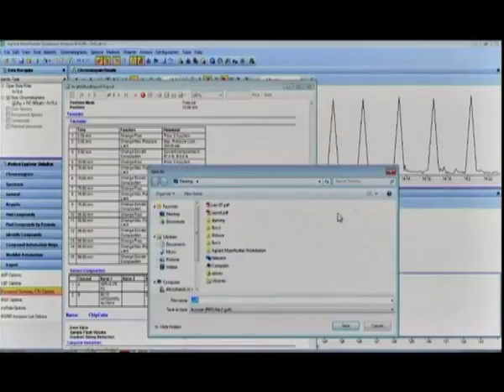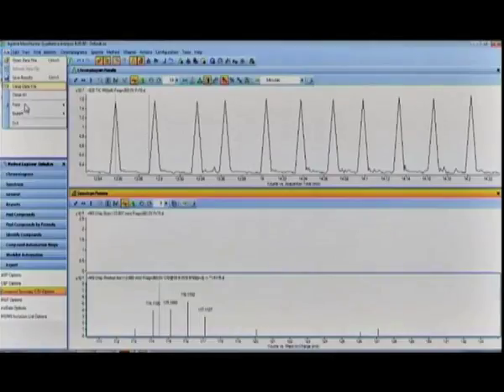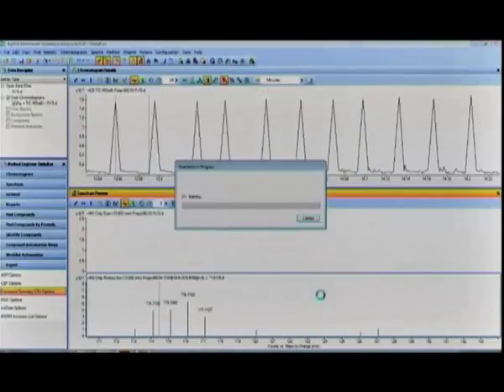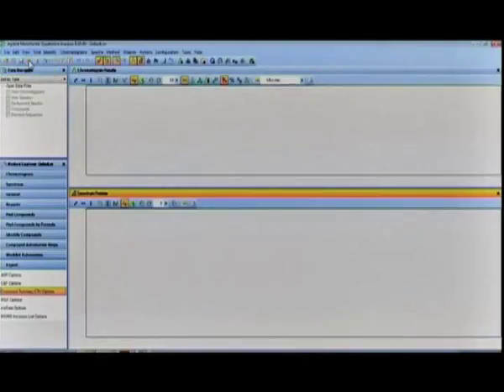Click on Export and you can convert the mass spec data .d file into a Mascot generic file, .mgf file, which can be used for analysis using Mascot. Finally, we can close the file by clicking the folder icon given in the qualitative analysis window.